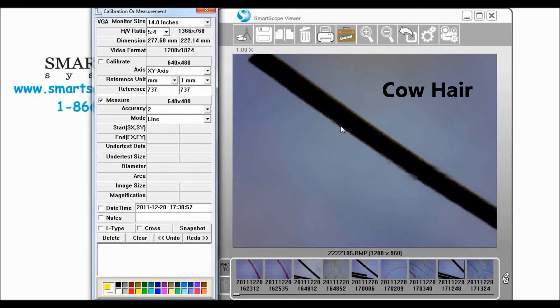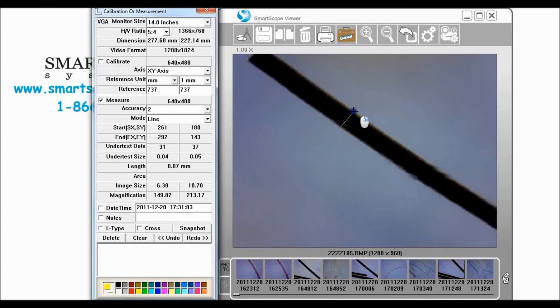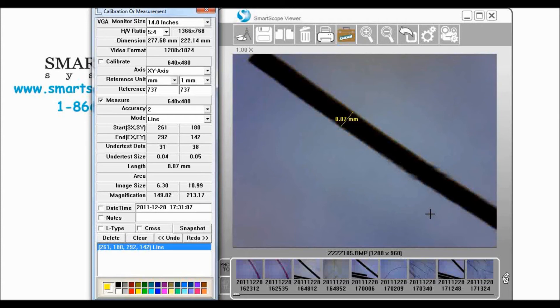I'm going to come in here. I've already done our calibration so I'm going to right click and move across and once I get that there I'm going to release.